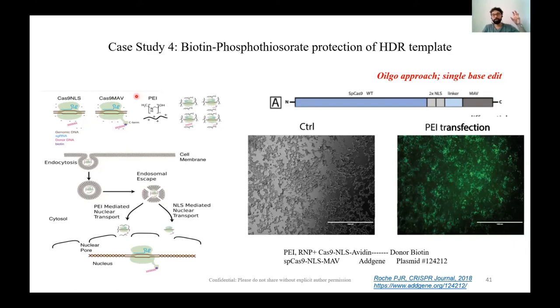And if you couple your oligo with biotin, this will form a bond with this monoavidin and ensure that the oligo is only close to your Cas9. So it is really targeted where you want your oligo to be. And you do this coupling in vitro before the start of the experiment, so you make sure that only your oligo is conjugated to Cas9.